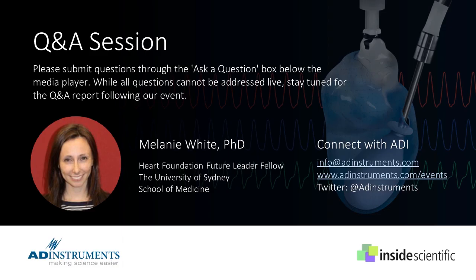A next question here. Dieter said, I sometimes struggle with slow effluent flow rate when using a constant pressure system, 70 millimeters of mercury, which makes me concerned that I'm not optimally perfusing both coronaries. Any tips on how to improve this? And is it always necessary to puncture the pulmonary artery?